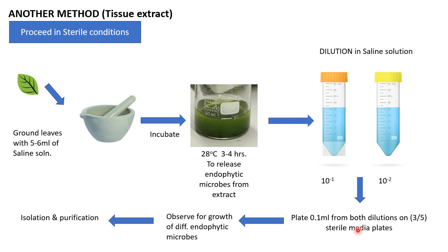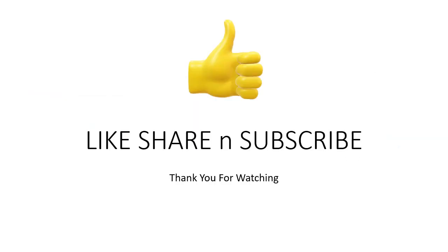After plating, incubate the sterile media plates and observe what types of endophytic microbes are growing. Then proceed to isolate, purify, and use them for your further experiments or purposes.